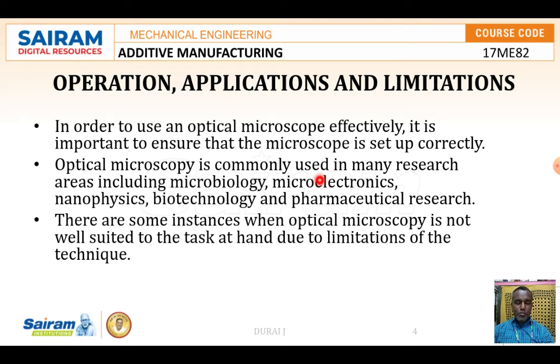Also, for the small components creating a microelectronic device, we can measure the dimensions and other things. Also, new viruses in medical diagnosis: their shape and size we can see through microscopic devices.